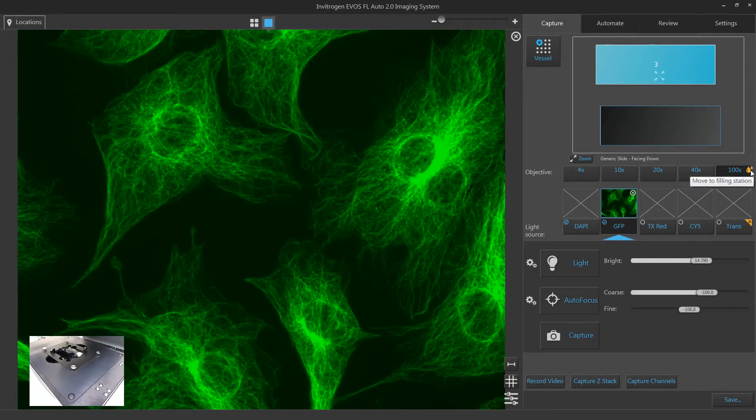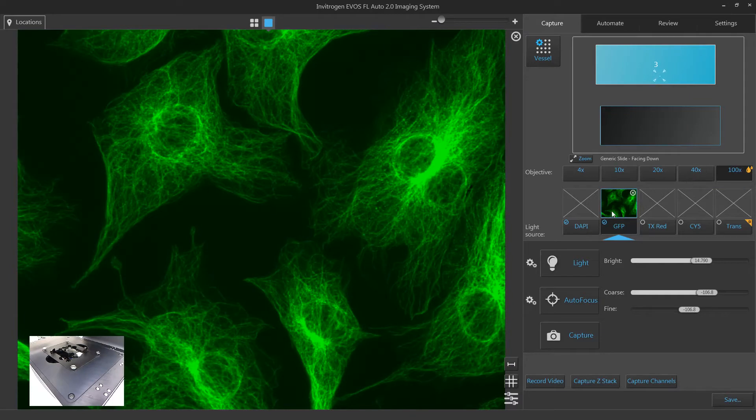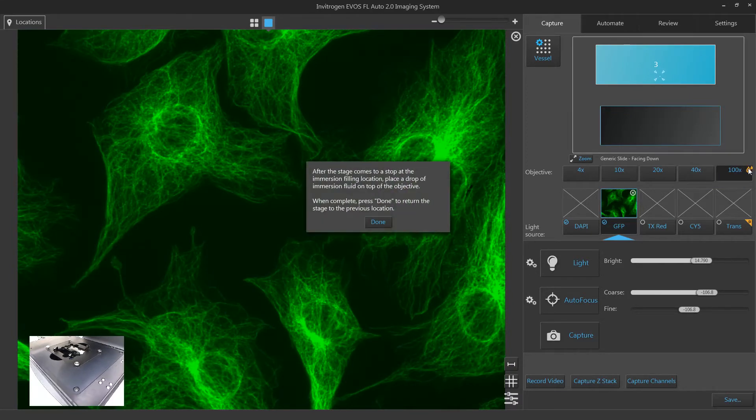Click the oil button to move the stage to an oil position that will allow you to place a drop of oil onto the objective lens.